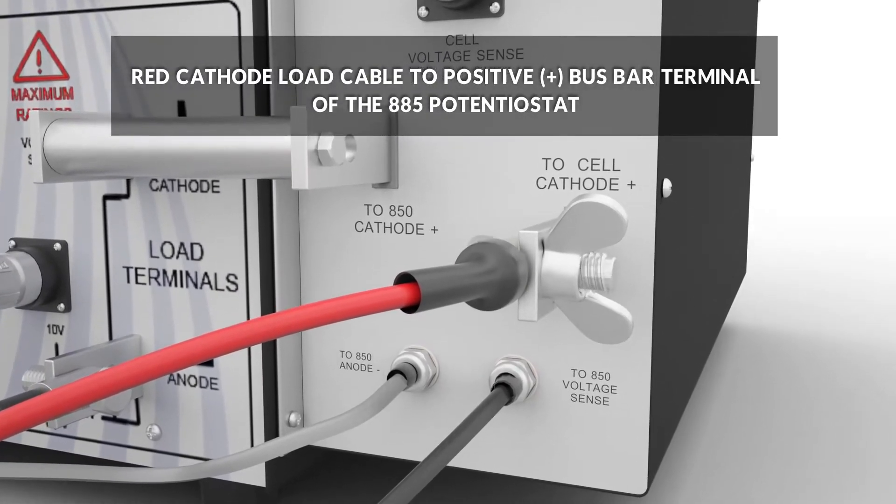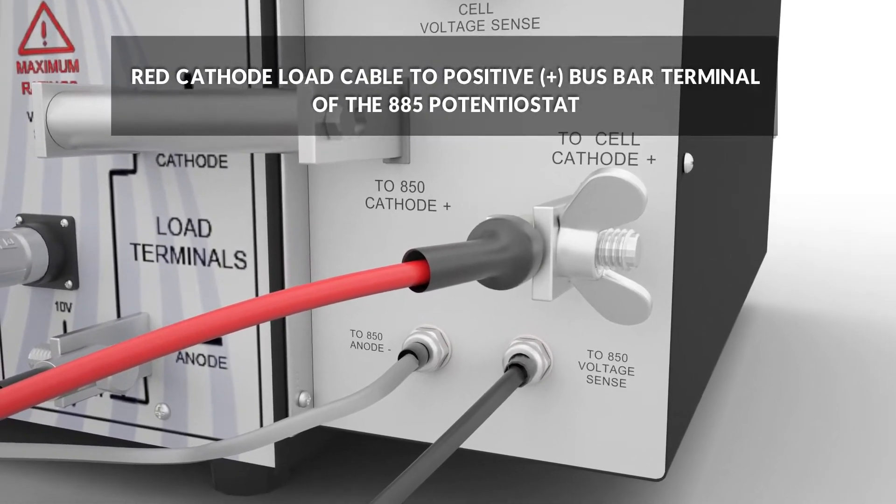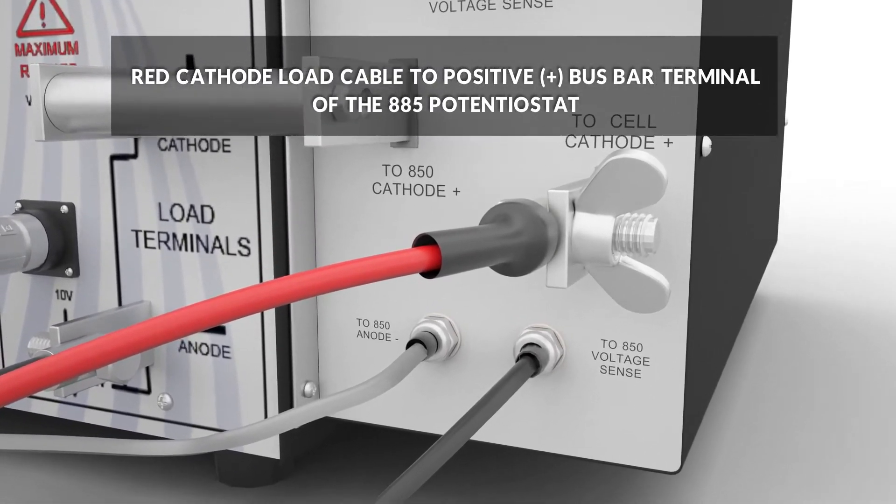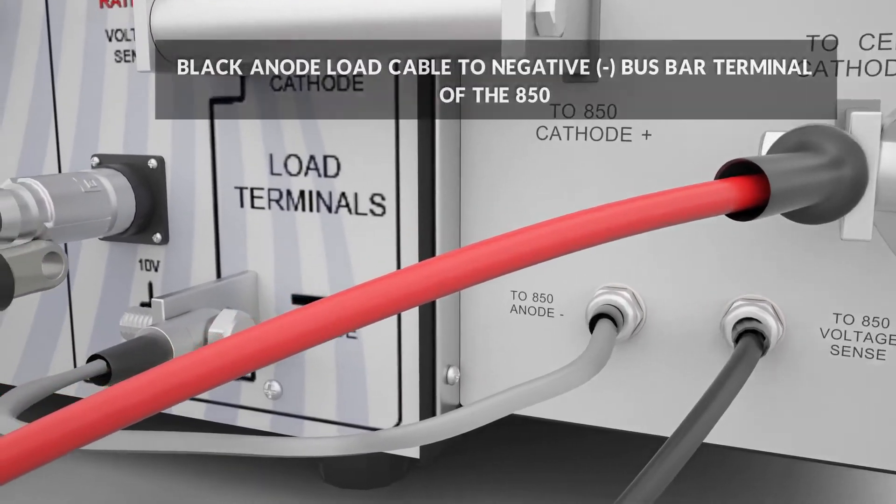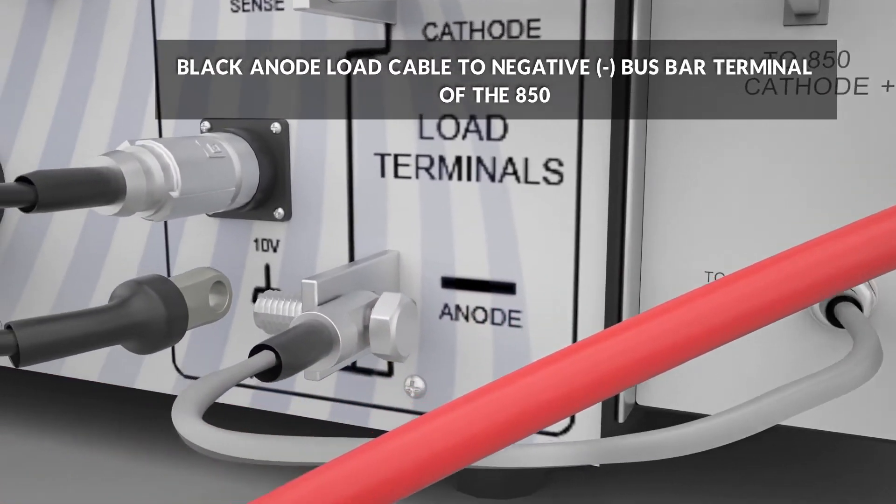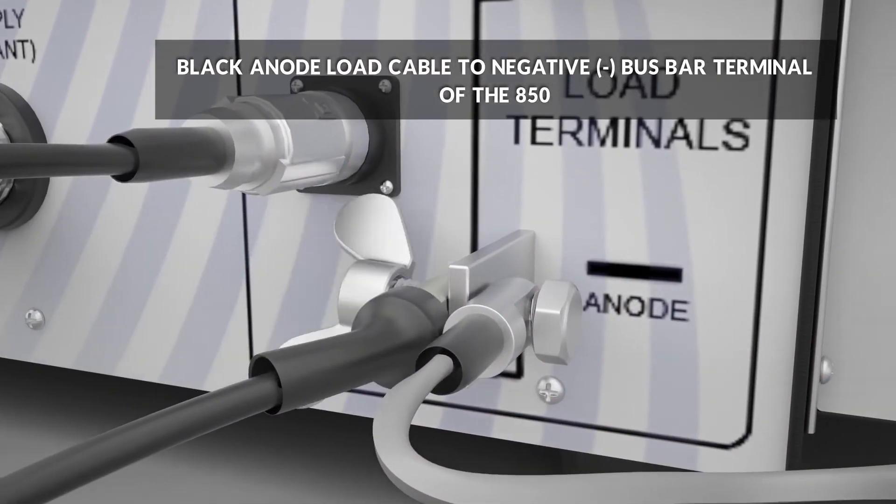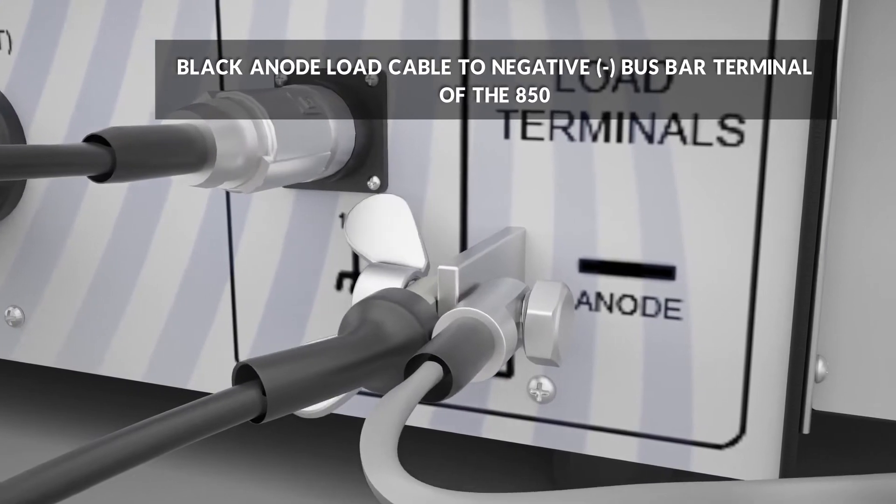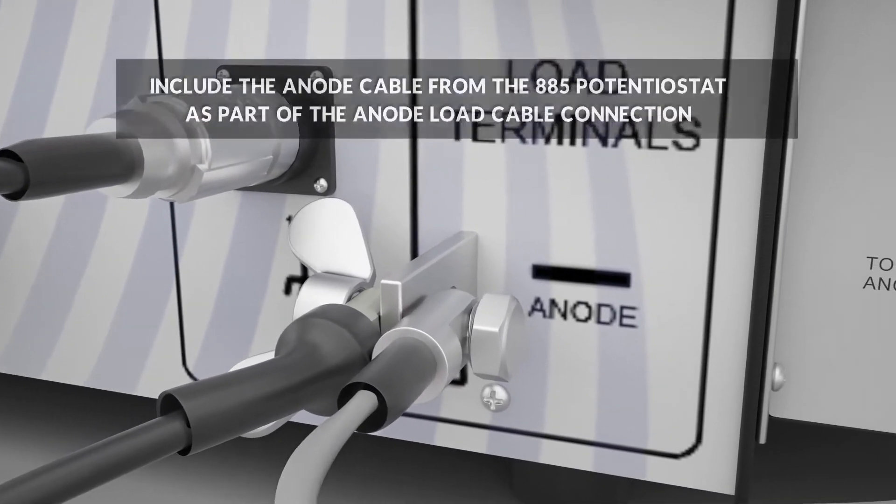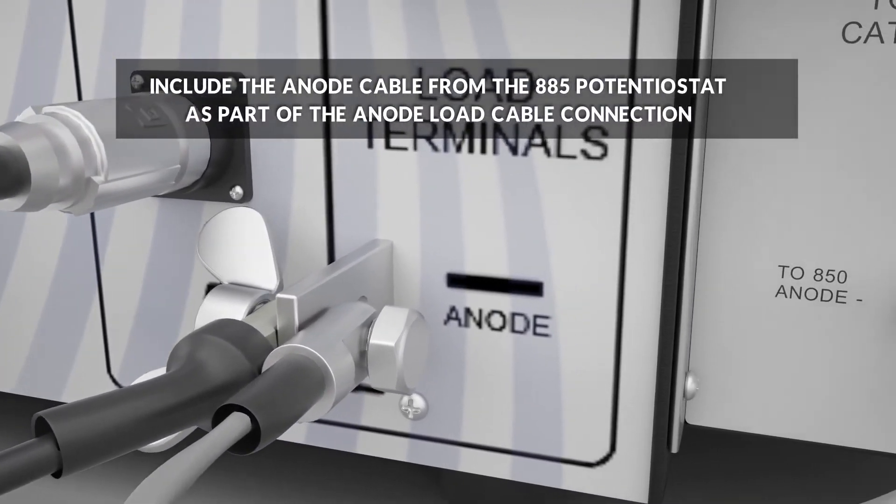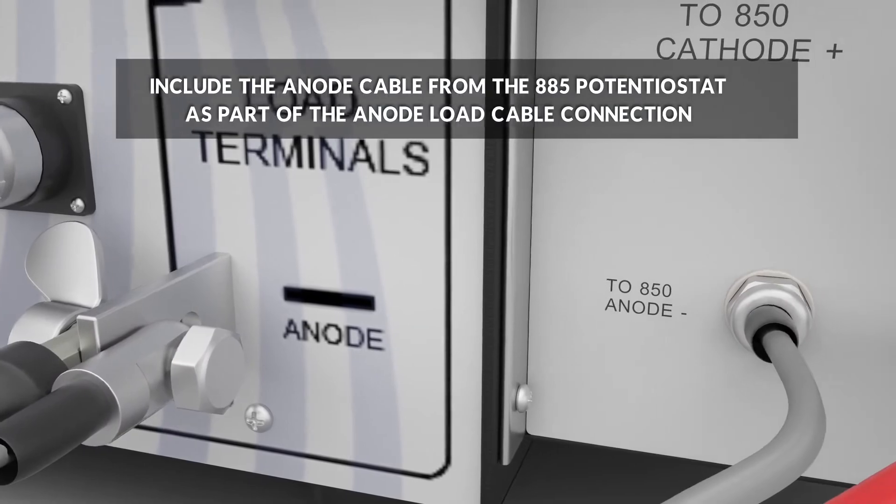Connect the red cathode load cable to the positive bus bar terminal of the 885. Connect the black anode load cable to the negative bus bar terminal of the 850. Include the anode cable from the 885 as part of the anode load cable connection.